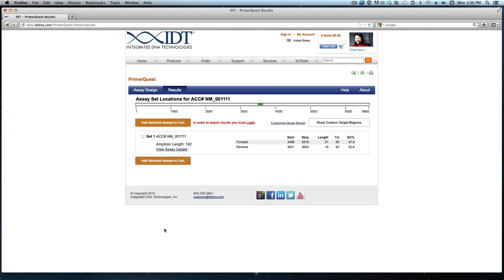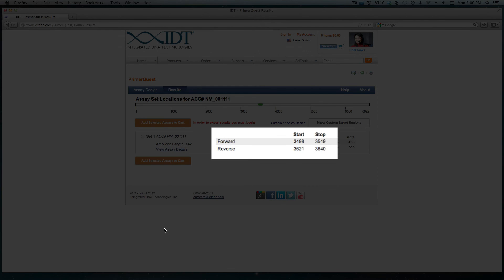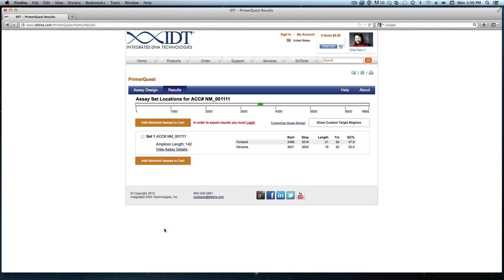As you can recall I typed in 3520 to 3620 as the target region. As you can see the stop location of the forward primer is at 3519 and the start location of the reverse primer is at position 3621. So the tool was able to design primers that exactly flank that target region.